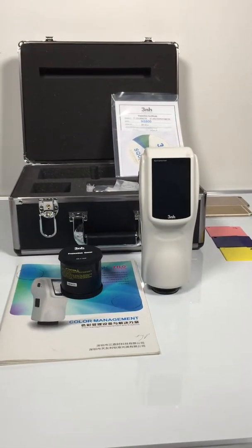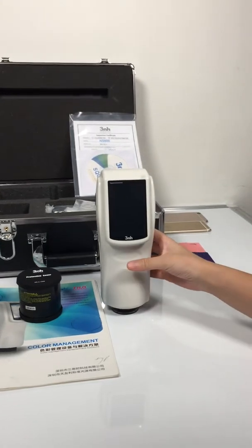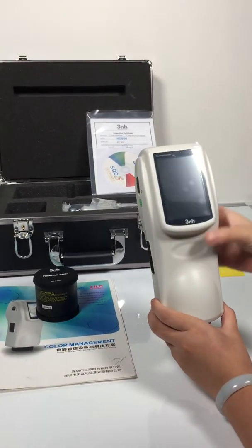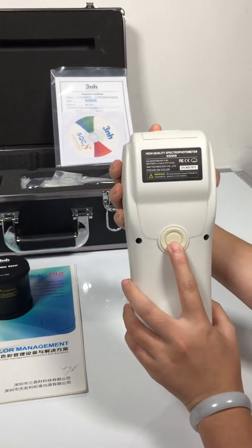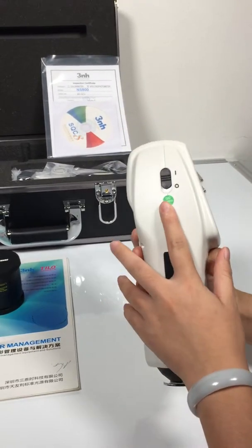Hello, welcome to the operation of NS800 model. This is the spectrophotometer, and this is the switch button and this is the test key. First, we turn on the machine.